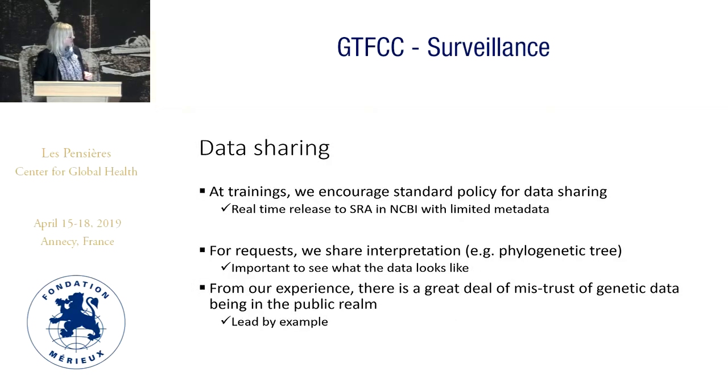So for data sharing, at the trainings, we do try to encourage our policy for data sharing. We can't enforce it. But we talk about real-time release to SRA and to NCBI, and we show them how to do that through Binumerics, and we show them how to do that not using Binumerics. And then for special requests, we usually share an interpretation, such as a phylogenetic tree, because it's really important to see what this WGS data looks like and to know how to interpret what you're looking at.